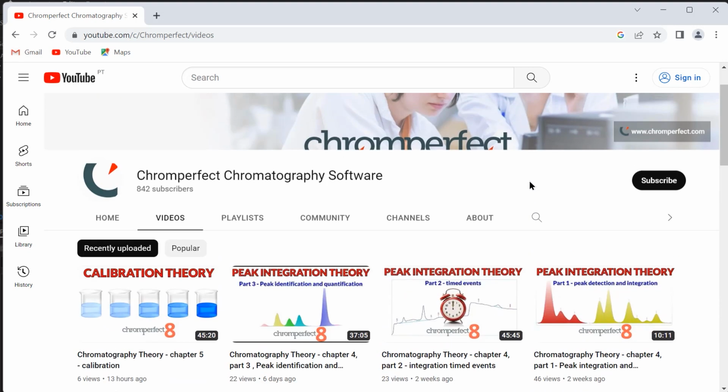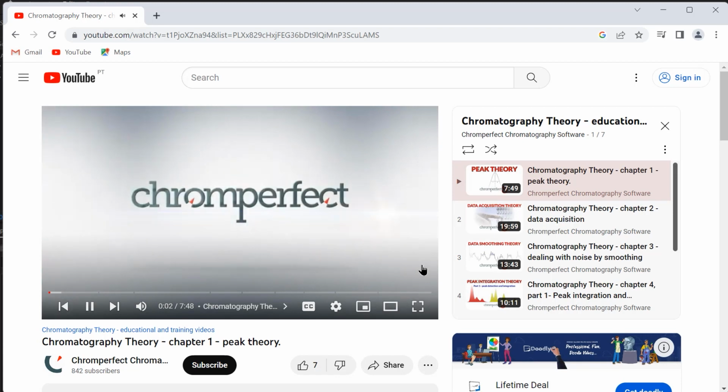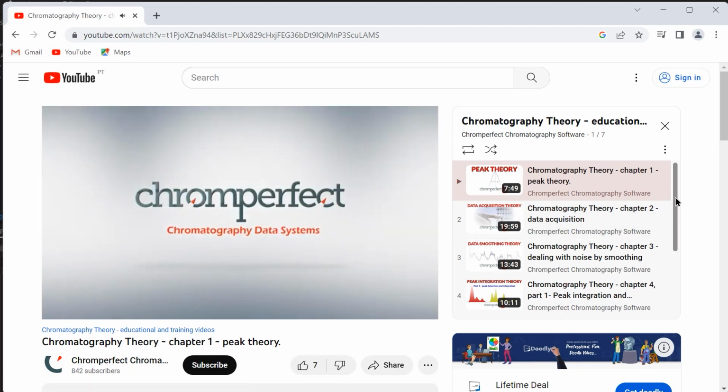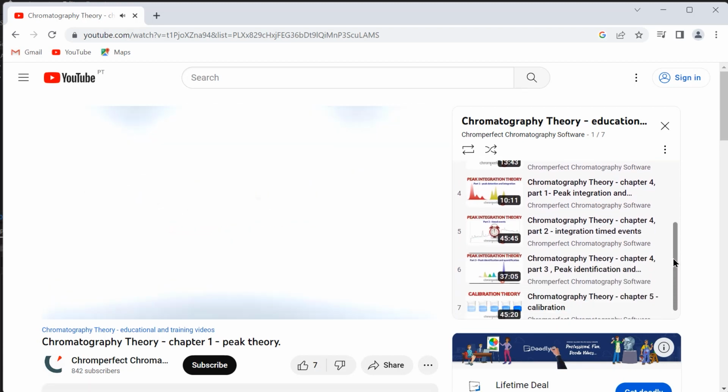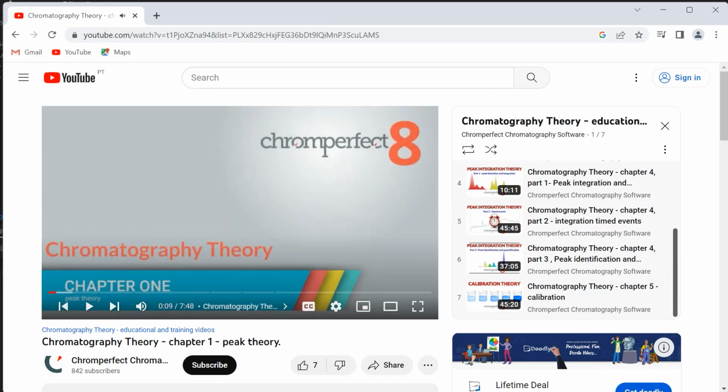I would recommend that you review the playlist titled The Theory of Chromatography, which is split into 5 chapters. Each chapter is a deep dive into the academic principles of each topic and the steps and operation within Chromperfect. The Theory of Chromatography has been converted directly from the section within the main manual.